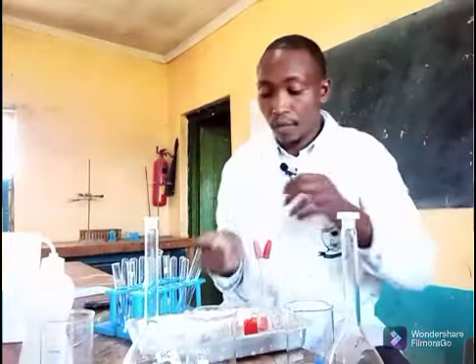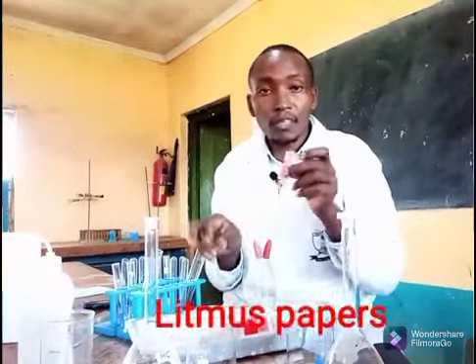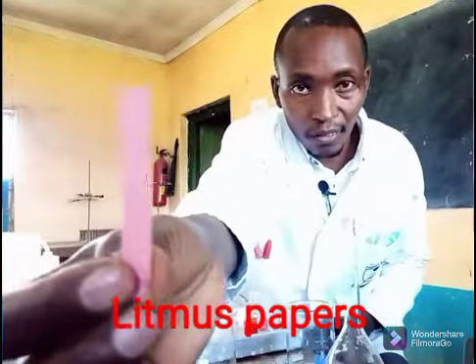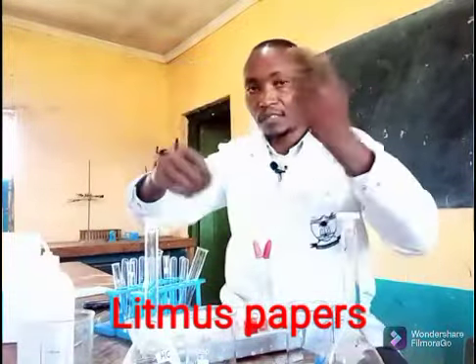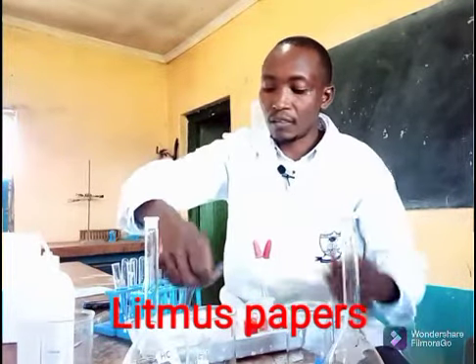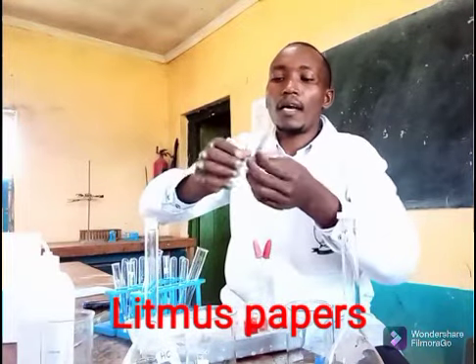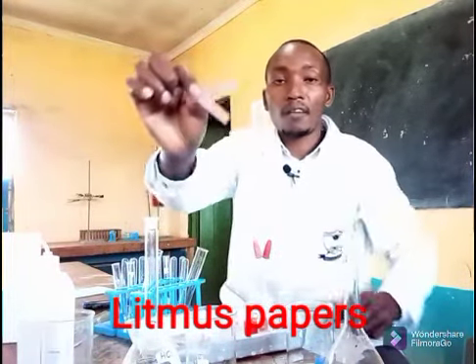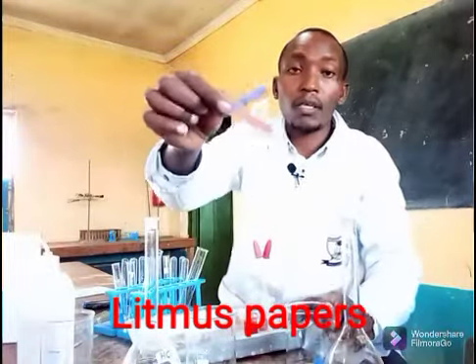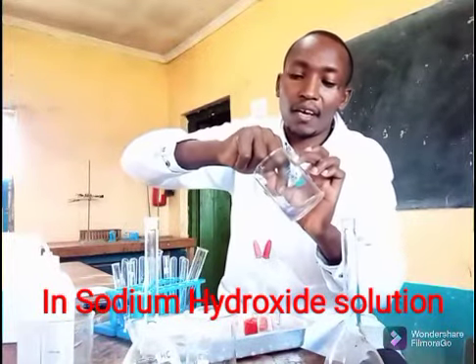To start with, I will start with litmus paper. This one we've said is a red litmus paper. We've said it appears pink, but we refer to it as a red litmus paper. The other one is blue, and I'm going to have the blue litmus paper and the red litmus paper in sodium hydroxide. I will lower it in there.